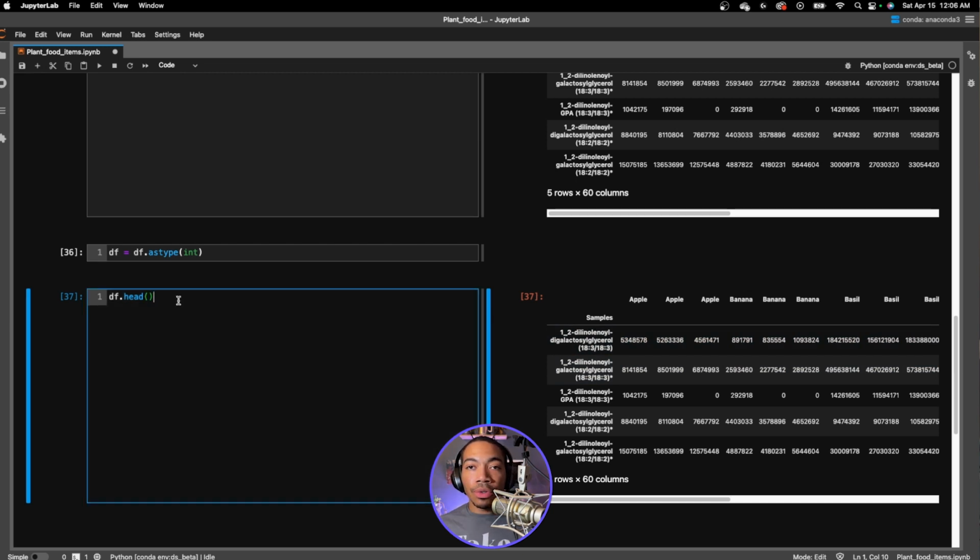To do that, we're going to use groupby. Chances are you've seen people group by various rows, but you can also group by columns. We can take advantage of this common column header. So we're going to take df.groupby, axis equals 1, and level equals 0. We're saying group by the columns and take the 0 level column header. In this case, there's only level 0.